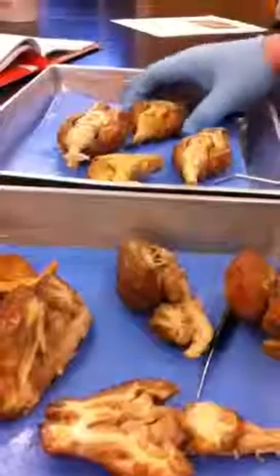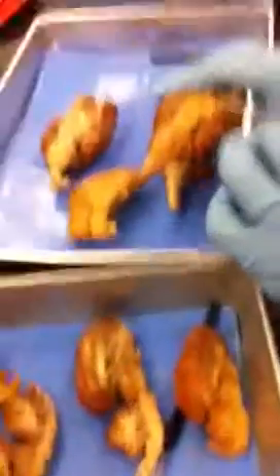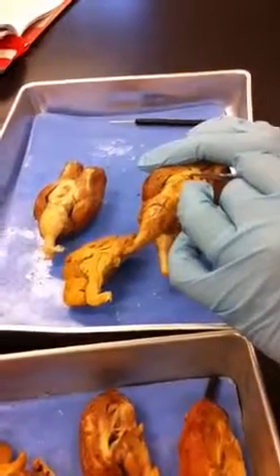Okay. So we can't really see thalamus on here, but here's the whole optic chiasm. And so just deep to this right here would be the hypothalamus.